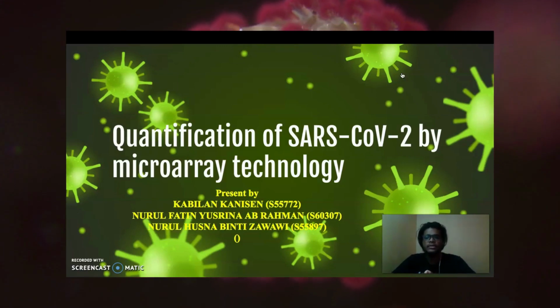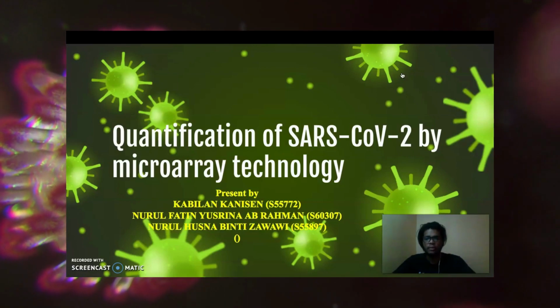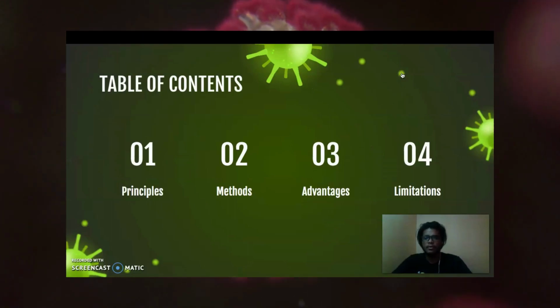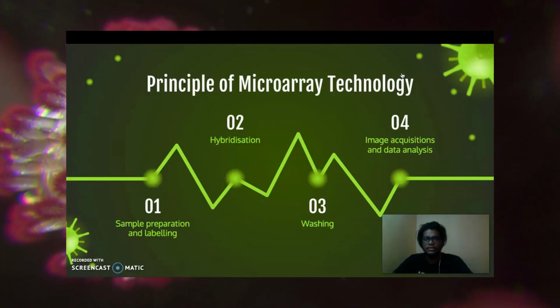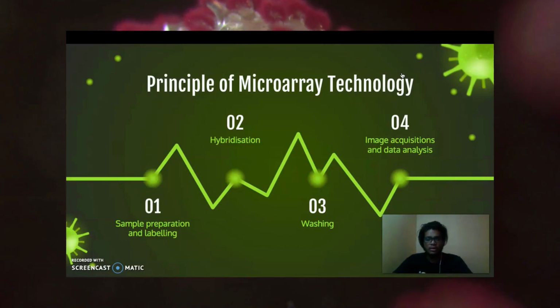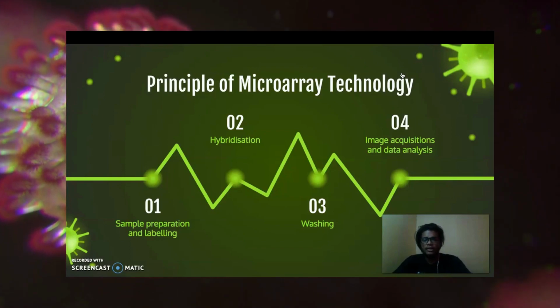Today I'm here to present our paper, which is quantification of SARS-CoV-2 by microarray technology. This is the table of contents. The first is the principle of microarray technology. First is sample preparation and labeling, then hybridization, then washing off, and finally image acquisition and data analysis.